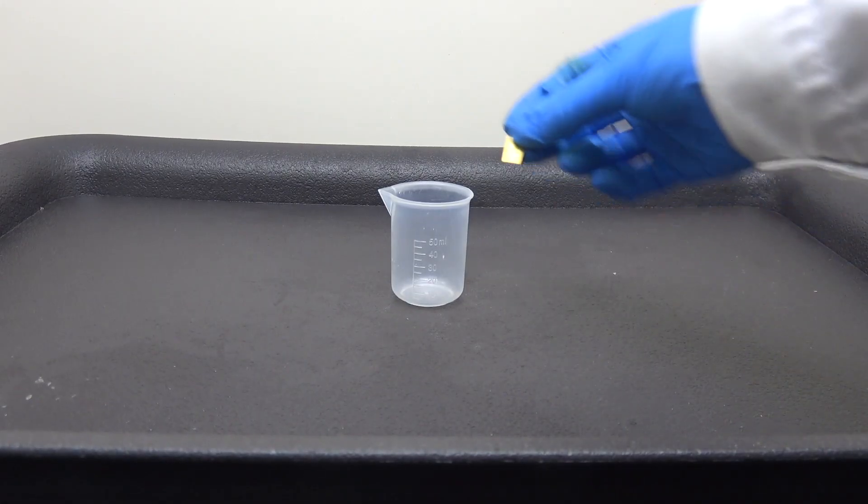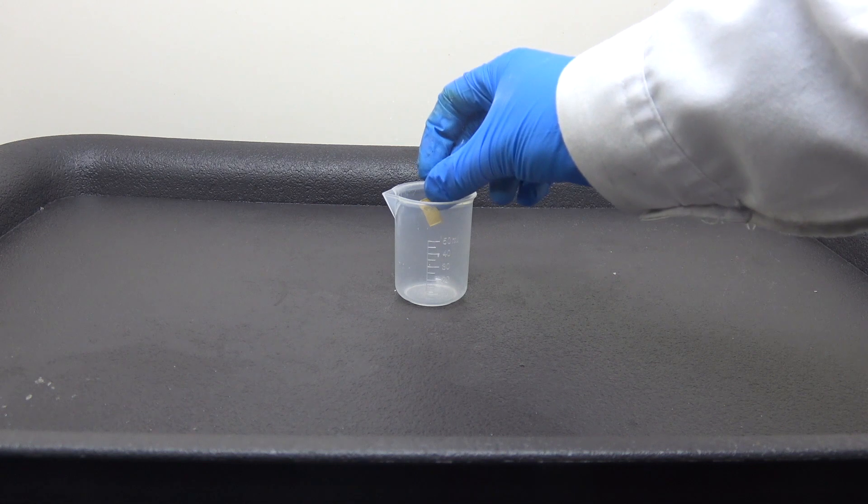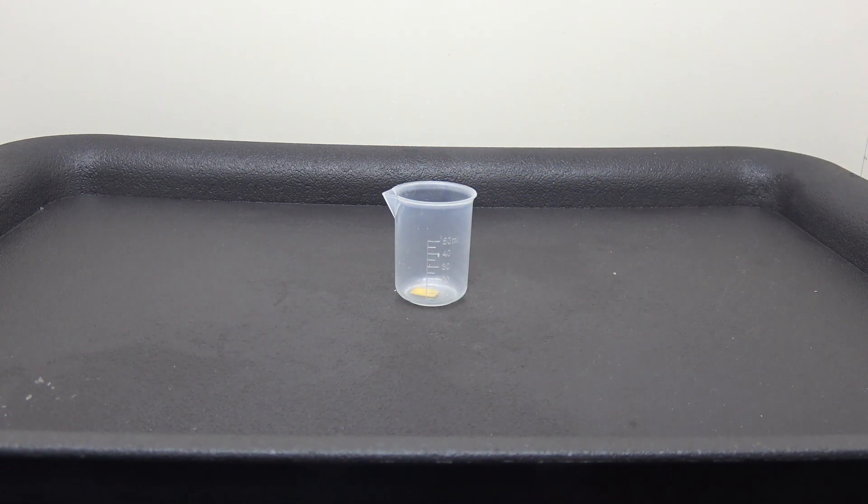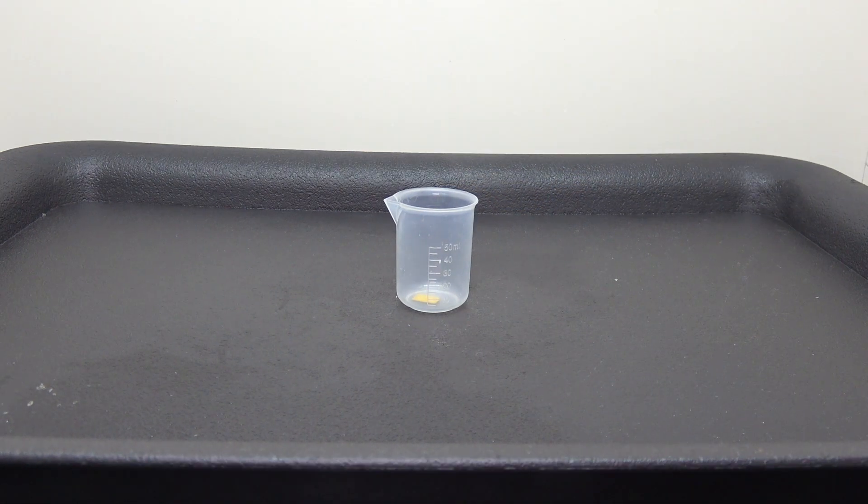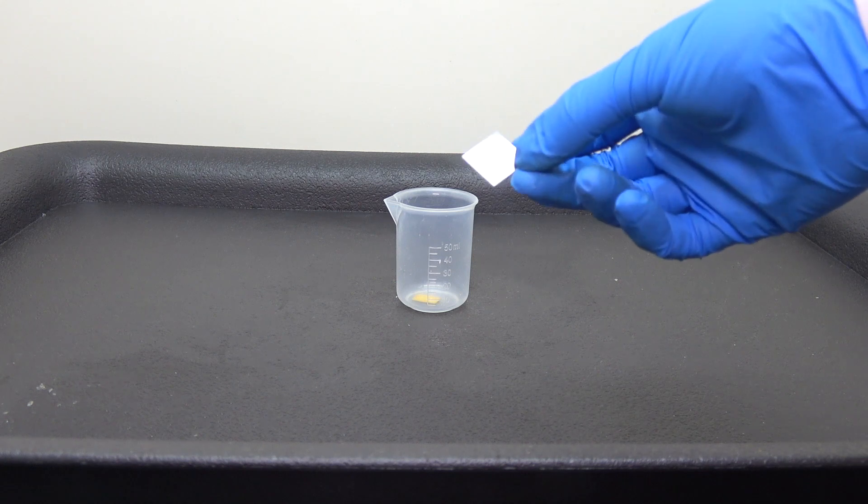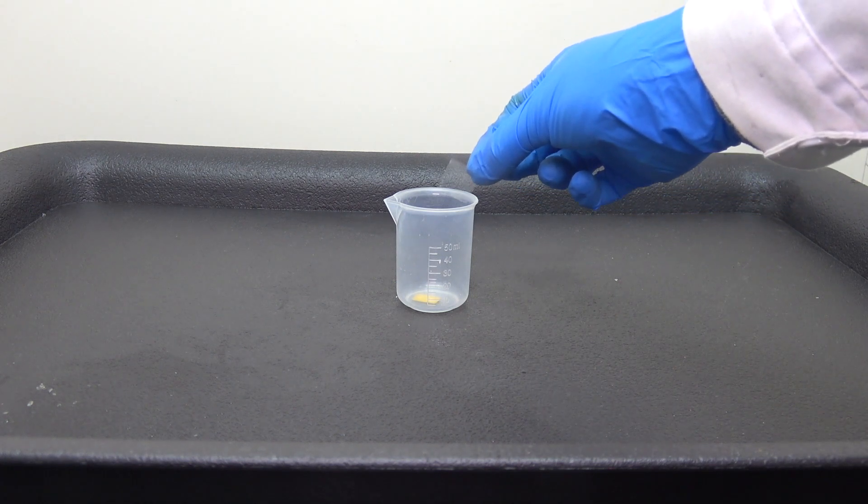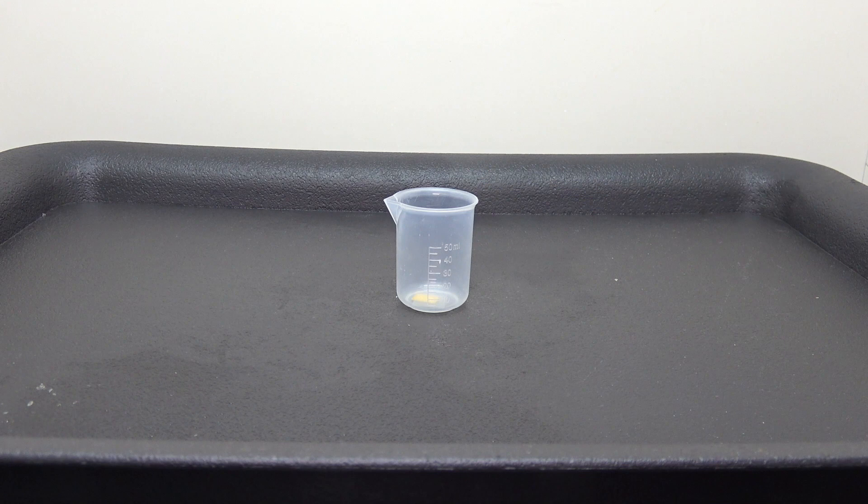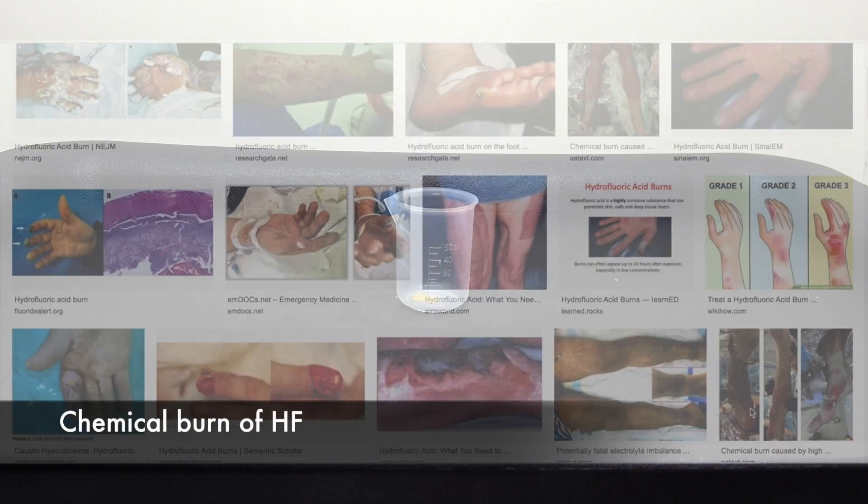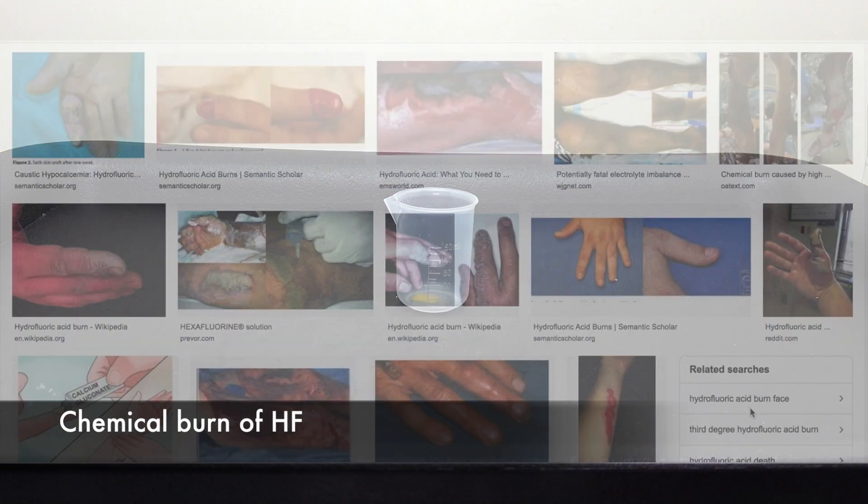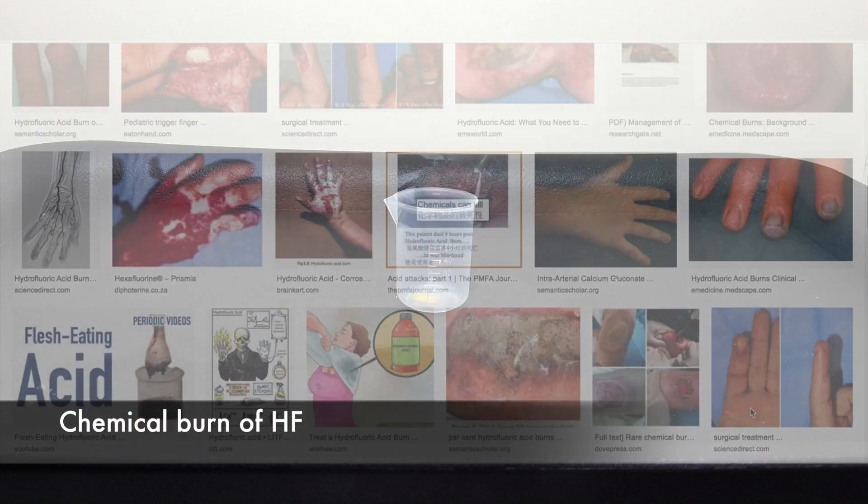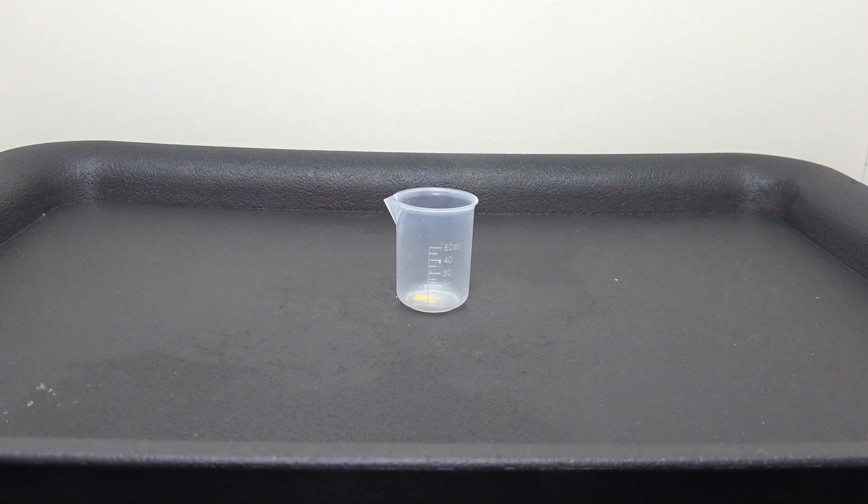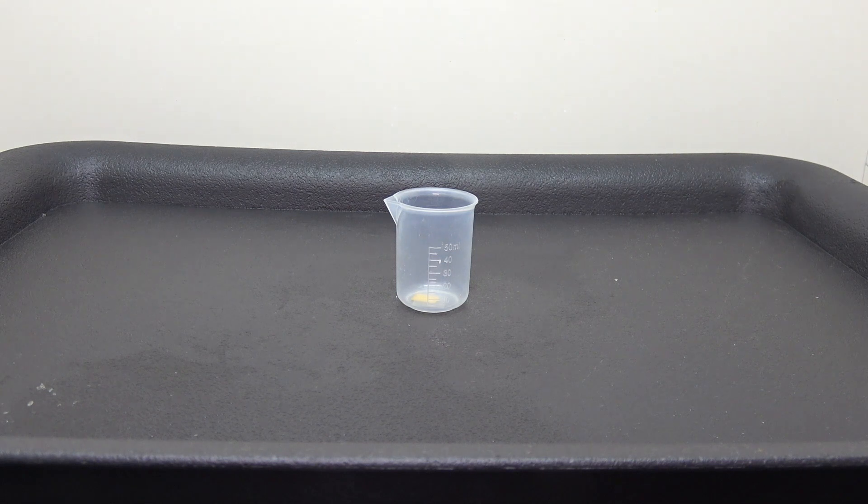Since hydrofluoric acid dissolves glass, unlike other trials, no glass will be used here for obvious reasons. And for demonstration purposes, I'm gonna throw in a piece of microscope slide. Okay, I know I don't usually put a warning in the middle of my video, but seriously, don't even think of trying to recreate what you're gonna see next. Obviously, I'm not gonna trust those puny little gloves that I use for other experiments. Just give me a second to suit up.